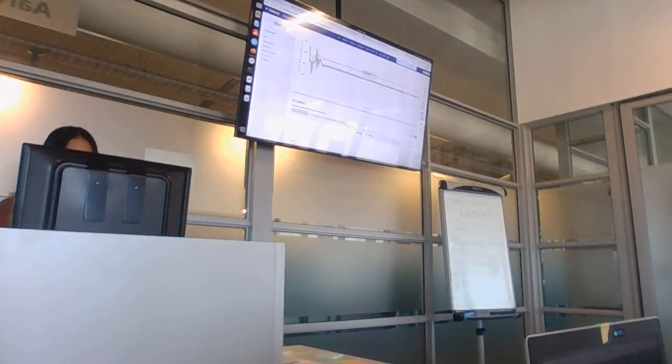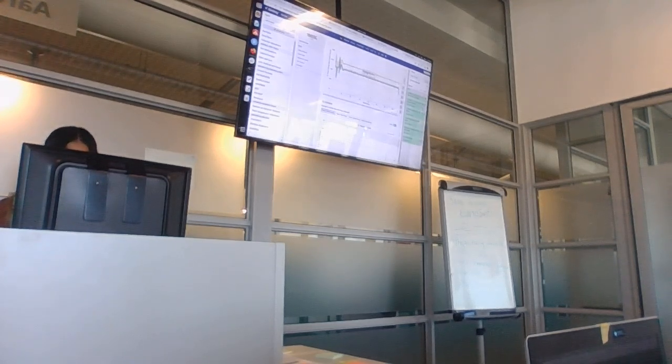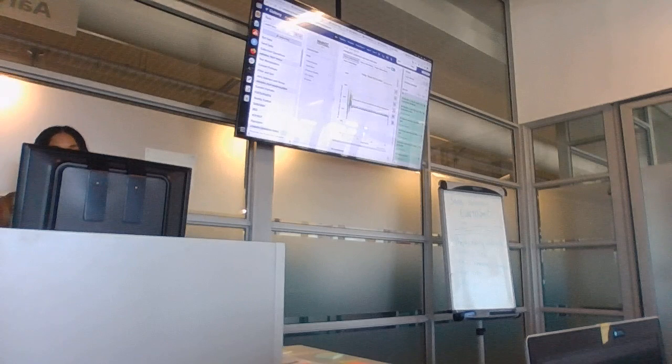I just need to find it now, which is also a good time to maybe show you, if you want to look at one of your past histories, there is something here called switch to history.